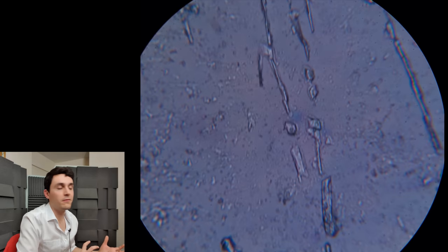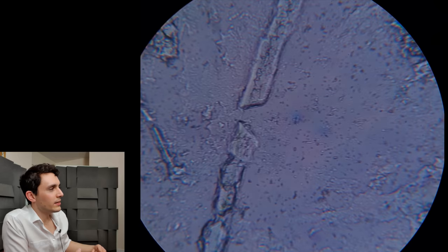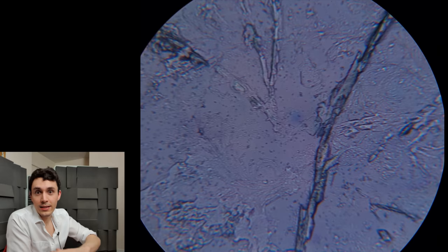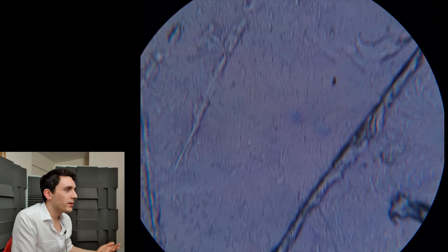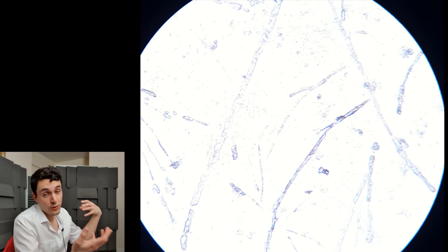Here's a closer look at the hyphae — this is what we call the hyphae of the fungus, these kind of fine filaments. You can see it broken apart into segments, probably for two reasons: first, I probably mechanically broke a lot of the hyphae by not smearing it nicely. But also I probably left the potassium hydroxide on for too long. And also the hyphae of Aspergillus is kind of segmented — it's all joined together, but in these segments.